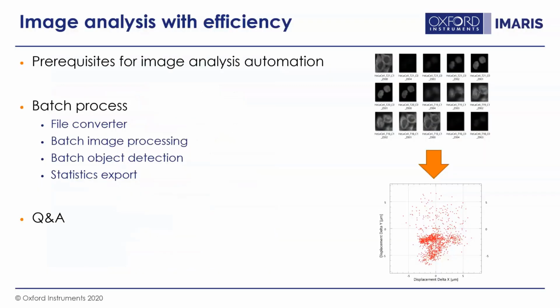Today, I'm going to share with you how to make your image analysis workflows more efficient with Imaris. I will first discuss some of the prerequisites for image analysis automation. This is important because a lot of times having good quality data really is the key for smooth and reliable image analysis down the line.